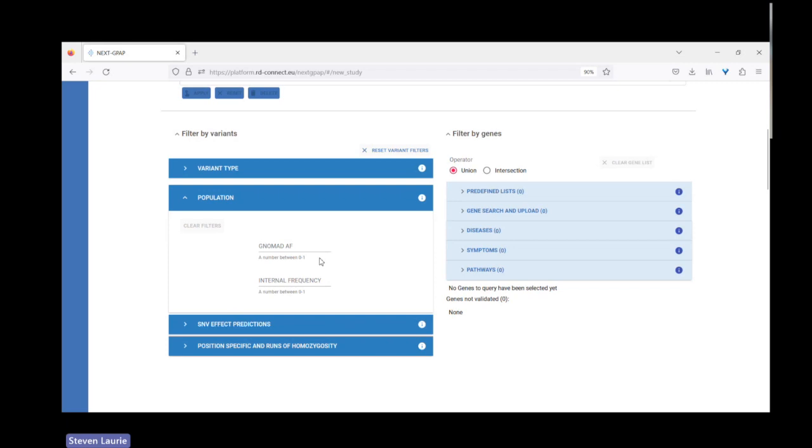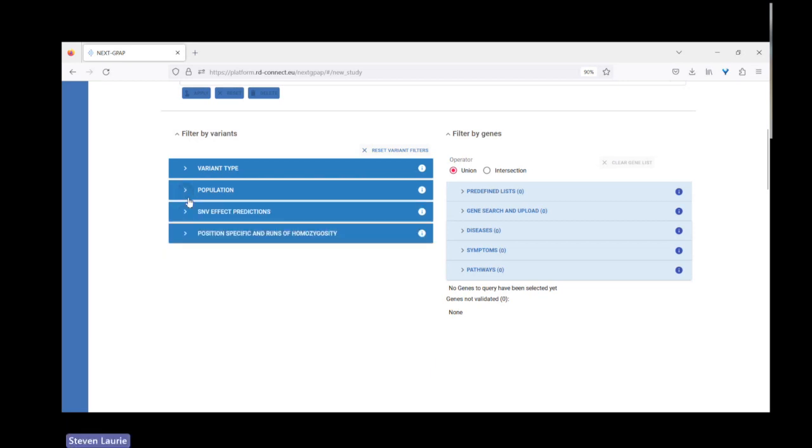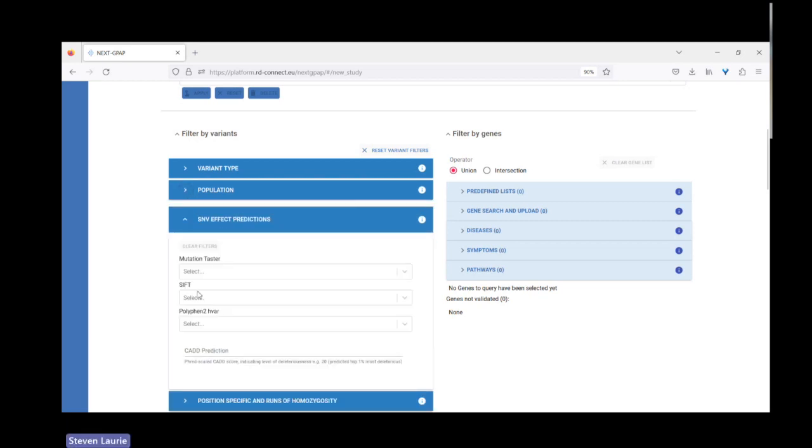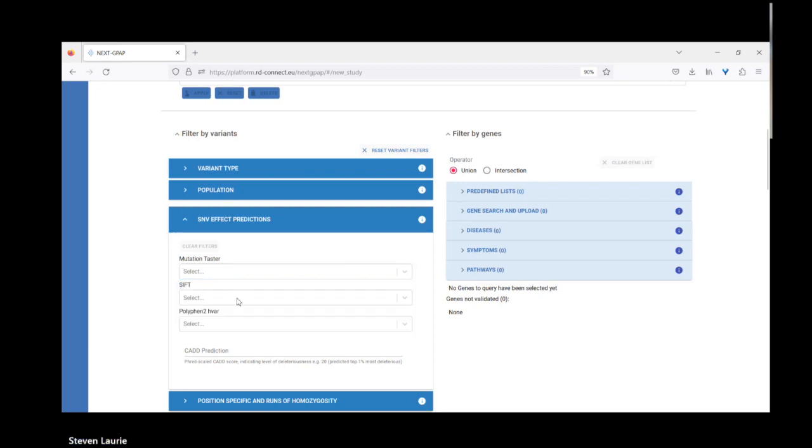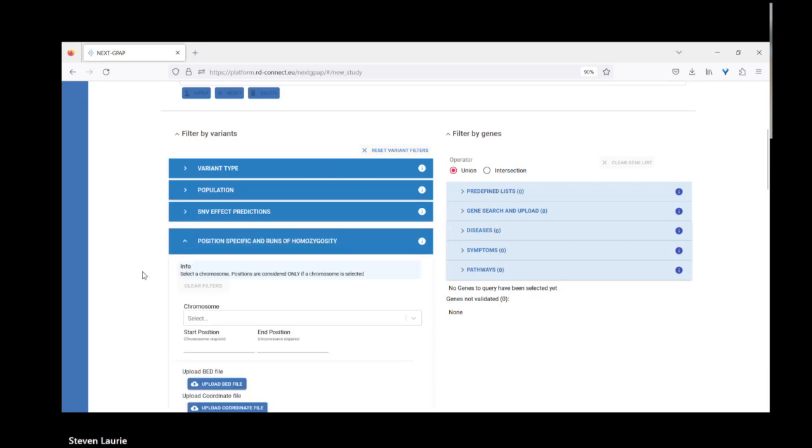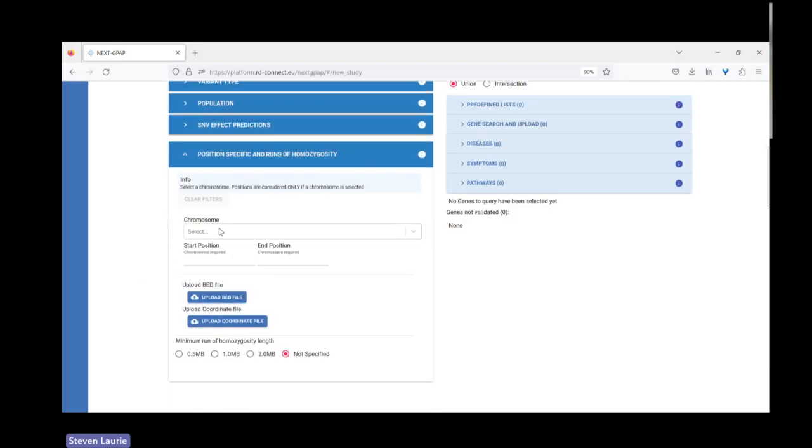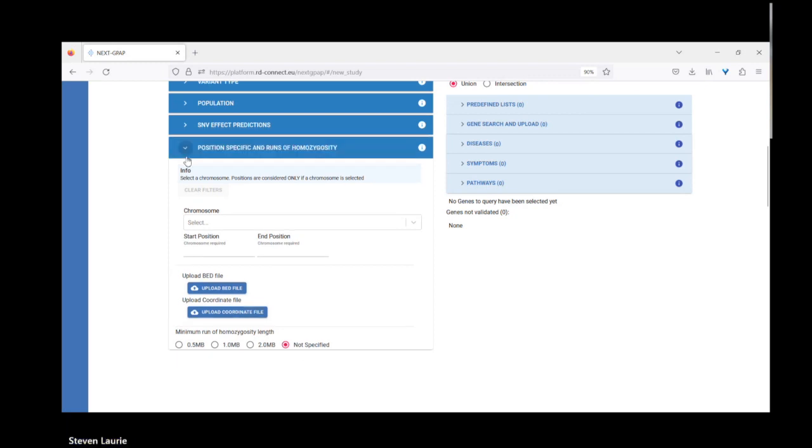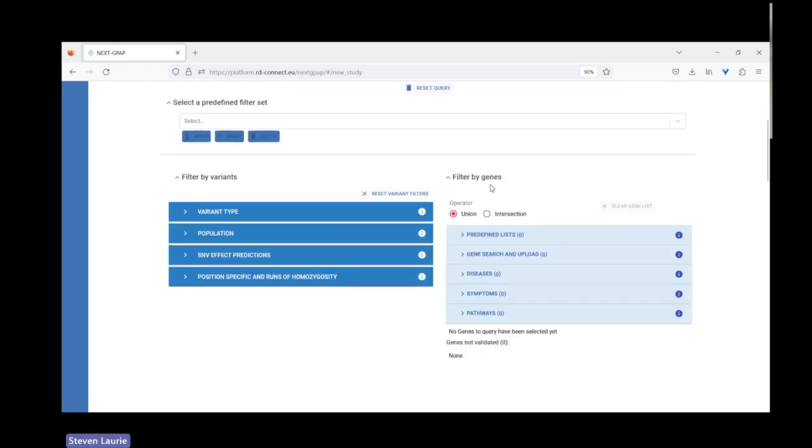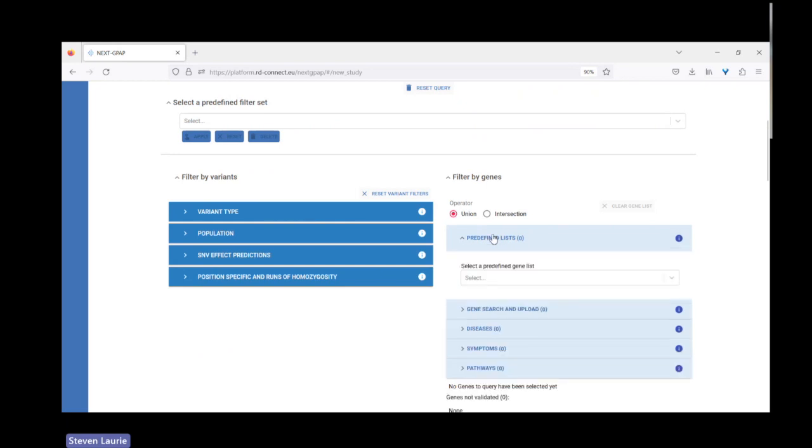Here we have the list of filters that we apply for the analysis. The first thing is the type of variant. You can look for variants that are in ClinVar as pathogenic or likely pathogenic. You can look for variants based upon their effect on the protein. We usually select high impact variants or moderate impact variants. In the population, you can filter by the gnomAD allele frequency and the internal allele frequency. We have the machine learning tools: Mutation Taster, SIFT, PolyPhen and CADD.